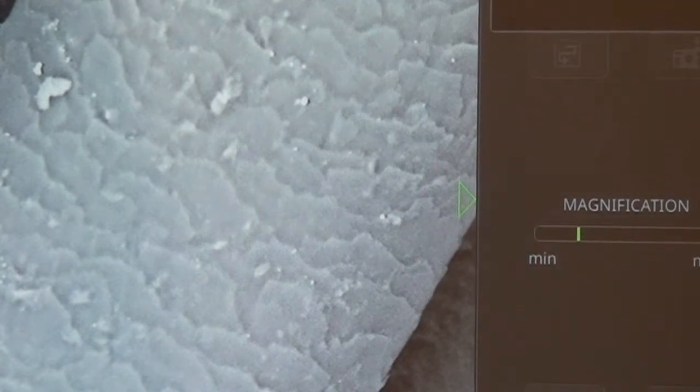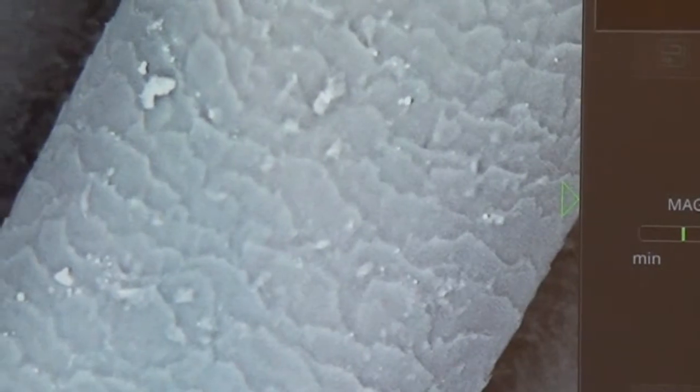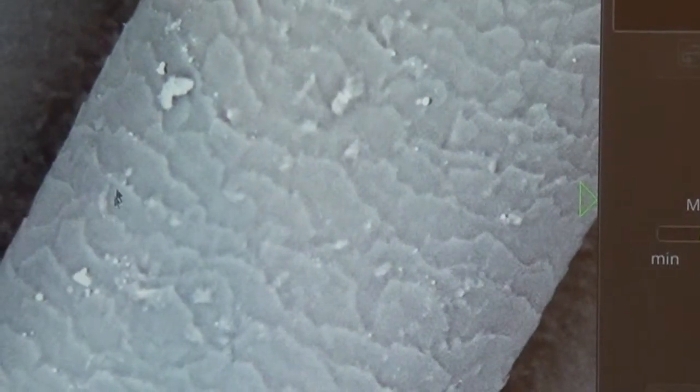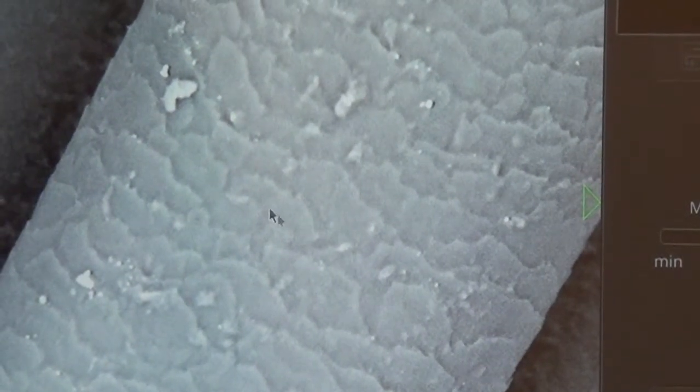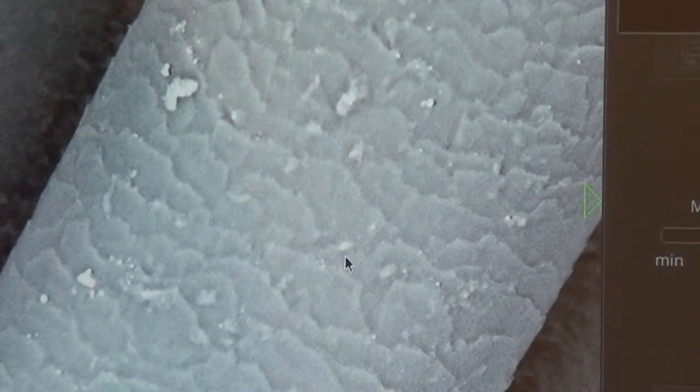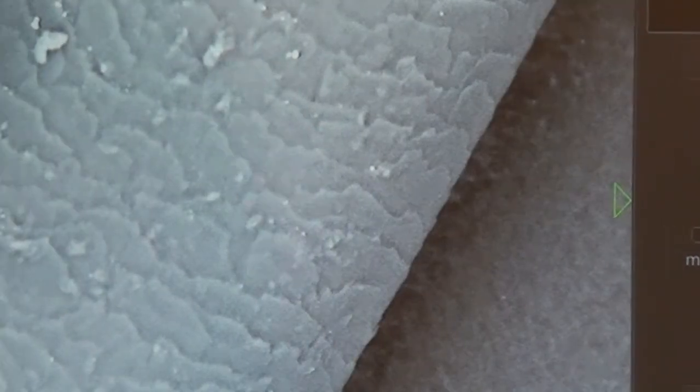We're at about 1550 right now. And then these little white flecks, these are my hair care products. That's not why we're showing you this. We're showing you this to demonstrate charging.